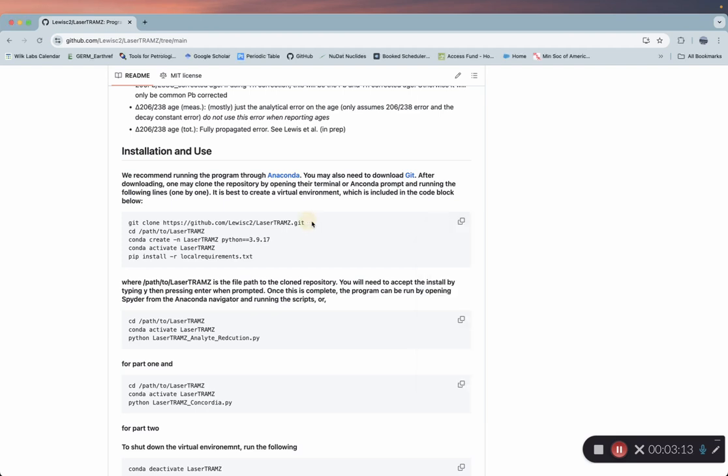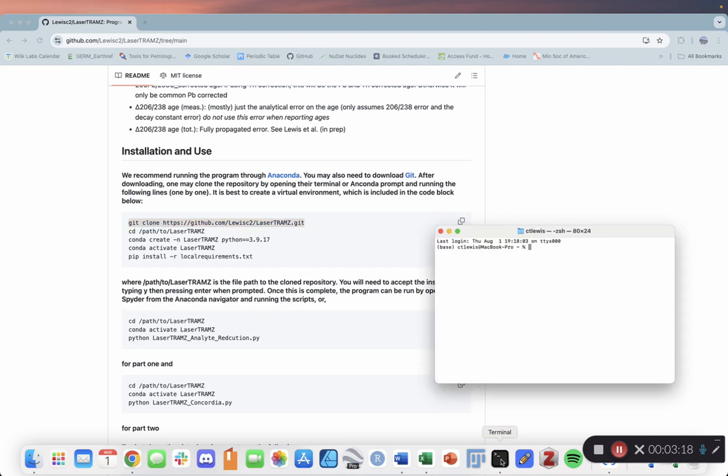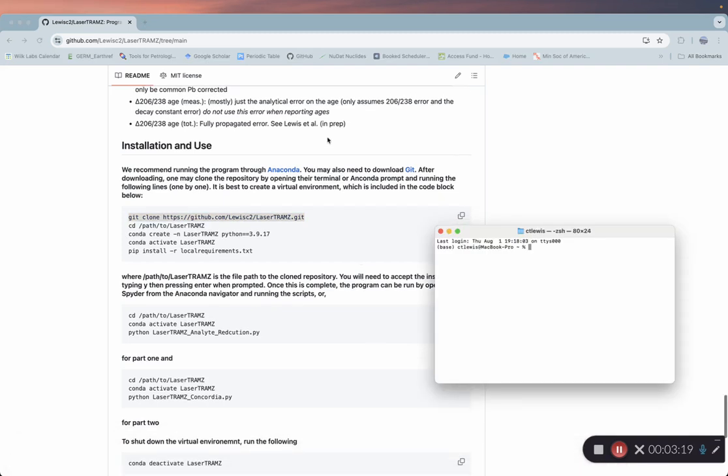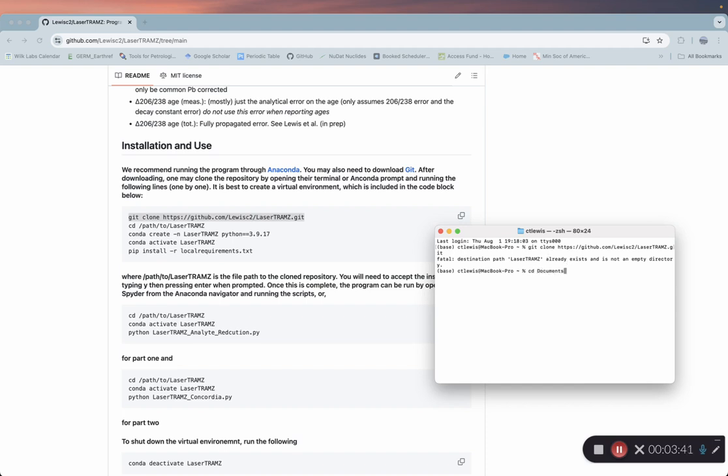Now we're going to copy and paste this git clone line. I should mention you need to install git as well. If you come to this GitHub page, click this link and it'll take you to git. Once you got that installed, go ahead and paste that line. I actually have LaserTramZ installed, so I'm going to need to go to a different folder so I don't overwrite that. I'll change directory to documents.